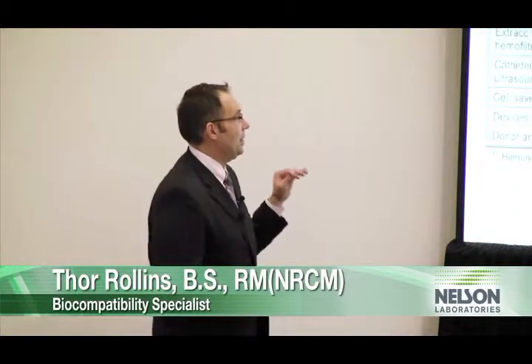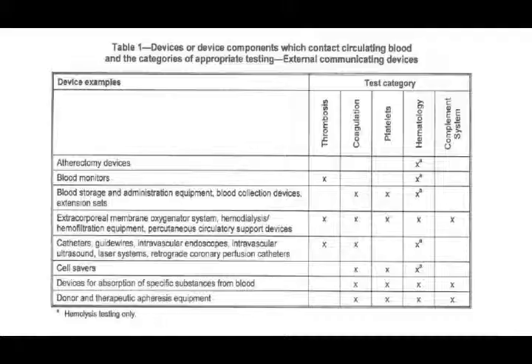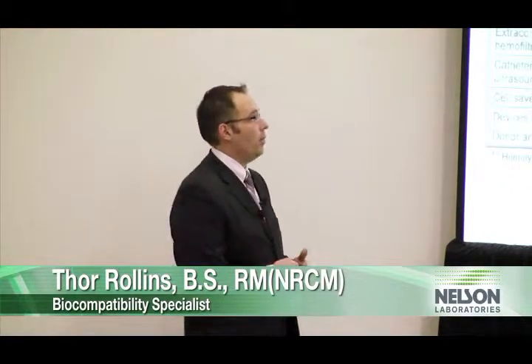What I'm going to be talking about today are 2 tests that you must do if you're submitting to the FDA. That's hemolysis and complement. Now, if you can see, complement up here is only listed in a couple things. But the FDA feels like there's a lot more risk to the patients than we've been testing. And it's a big potential risk. Complement, the end result of complement is anaphylactic shock, okay? So the risk to the patient is pretty high. So the FDA has a big concern with complement.